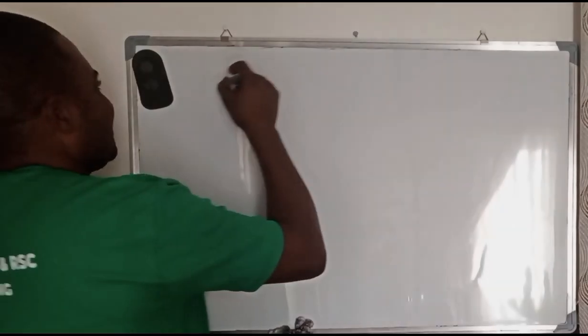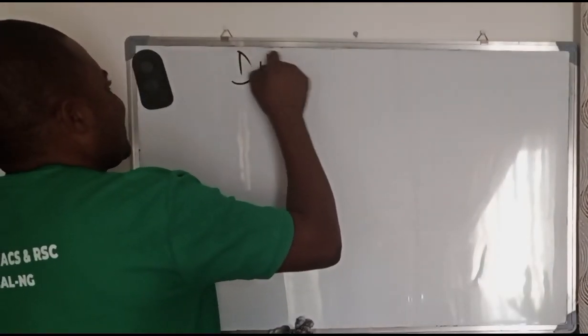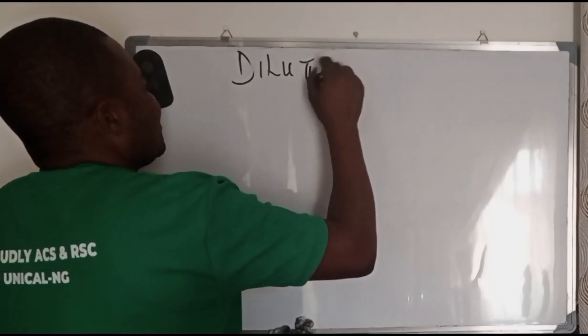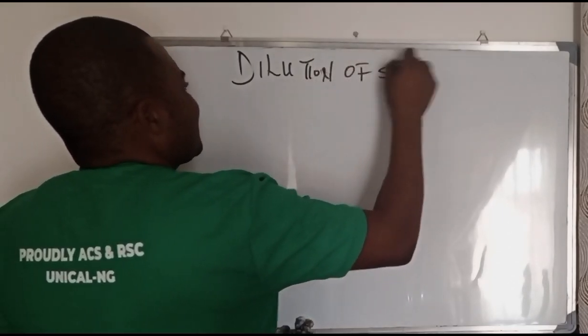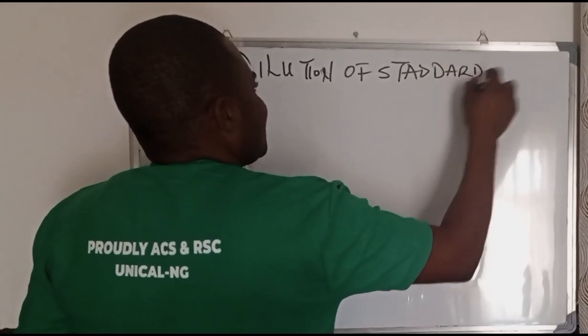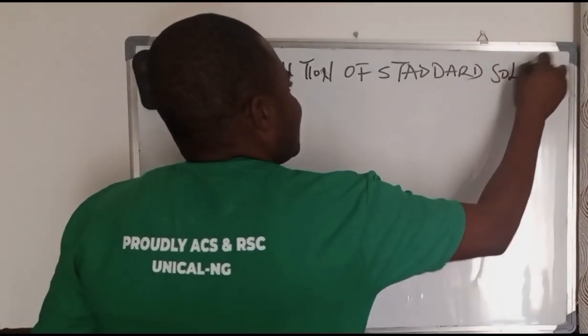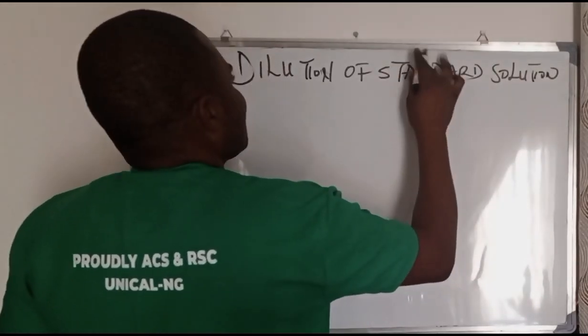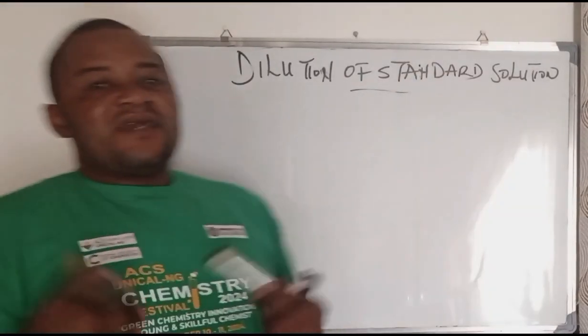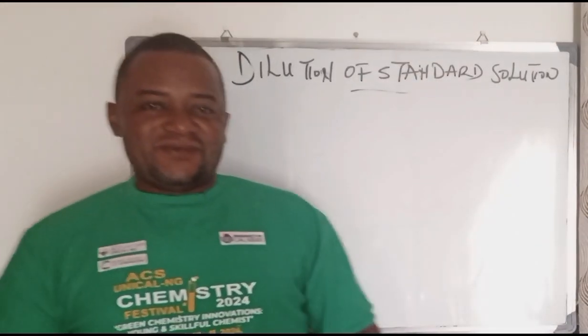Okay, so today we'll look at dilution of standard solution.